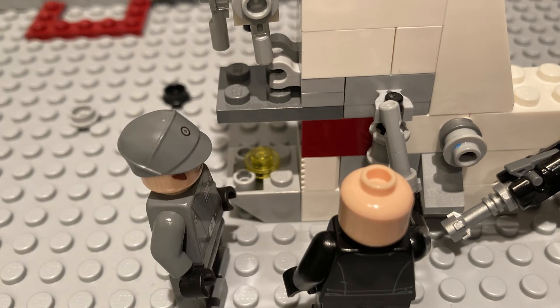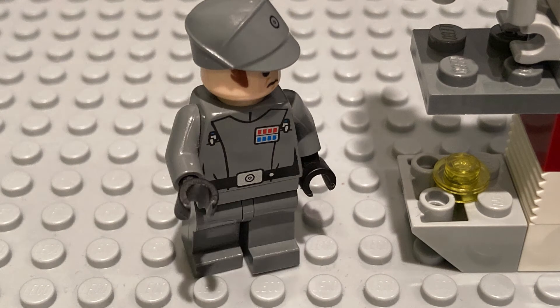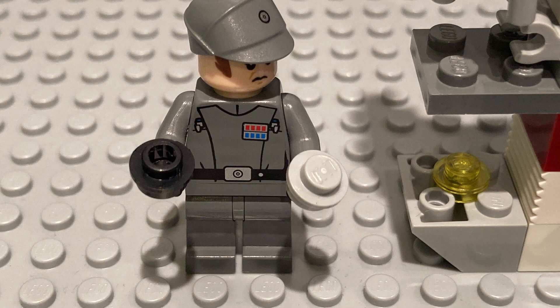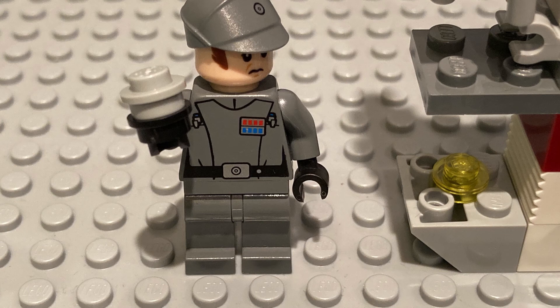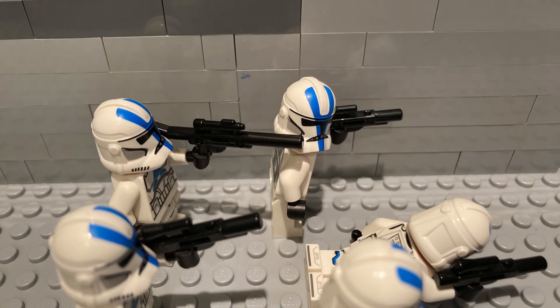Now we will attach the stage knobs, which move the stage back and forth. Next, attach the diaphragm and the condenser lens. The condenser lens condenses the light so you can look through the microscope, and the diaphragm allows different amounts of light to pass through.